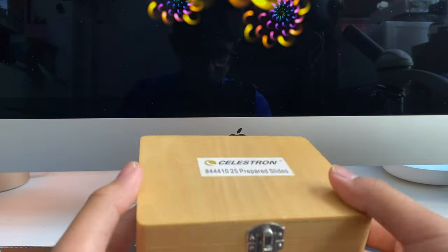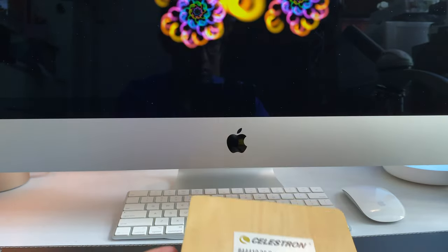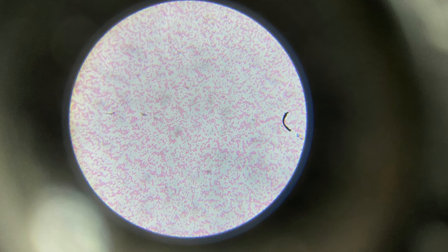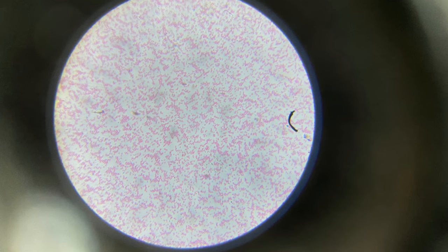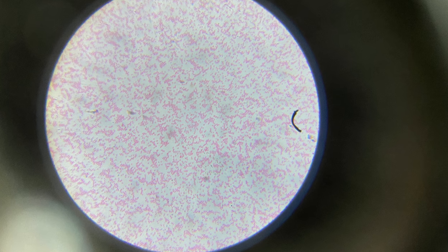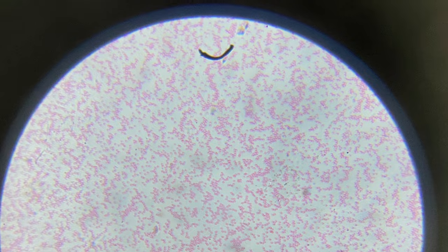For testing image quality, I'm going to use this set of prepared slides. This is the image from the smallest microscope, the SS110. As you can see, it's quite good, but the color temperature is a bit off and the edges are quite blurry.